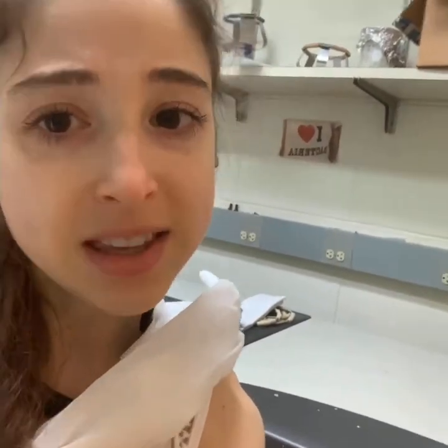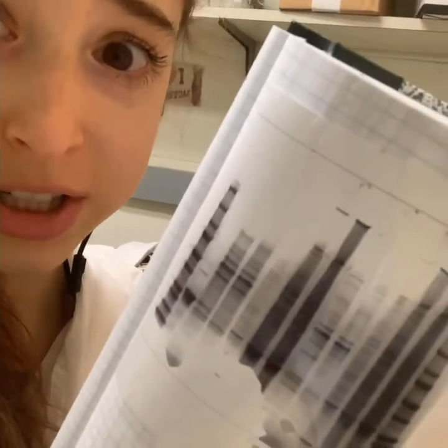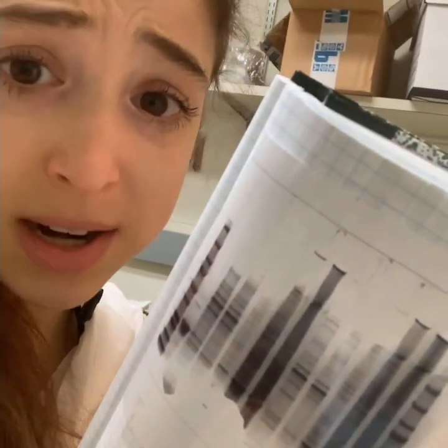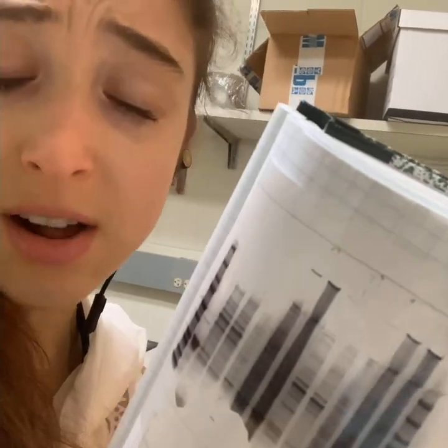Well, sometimes proteins don't express well in bacteria, and sometimes they express well, but they don't fold properly, and then they get clumped together in aggregates called inclusion bodies. So you can run gels of the different portions, like the soluble portion, the membrane bits, and that sort of thing, to see if your protein is getting expressed and ending up in inclusion bodies, or it's not getting expressed at all.